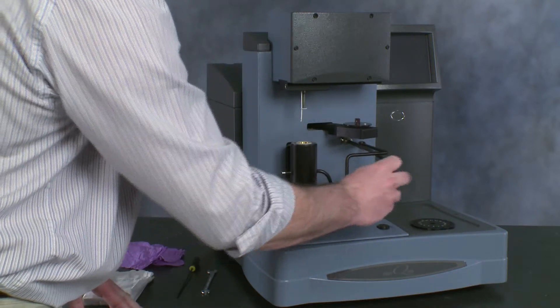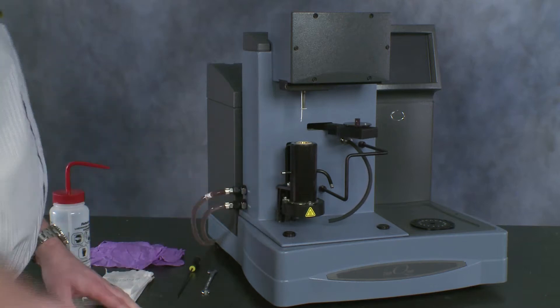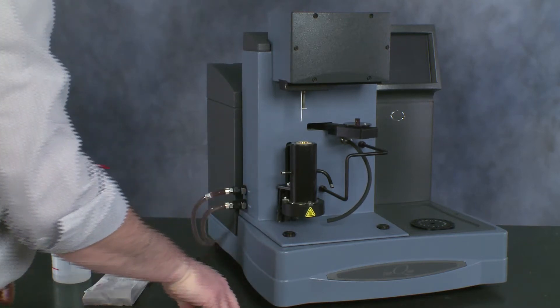We want to remove the purge gas tube so that we can remove the jacket, and then we can start loosening the nuts on the furnace itself.